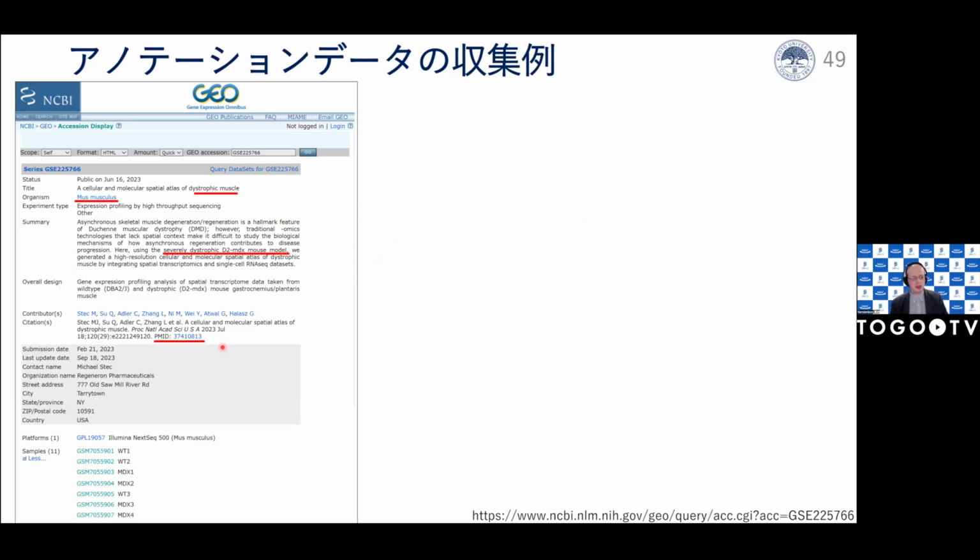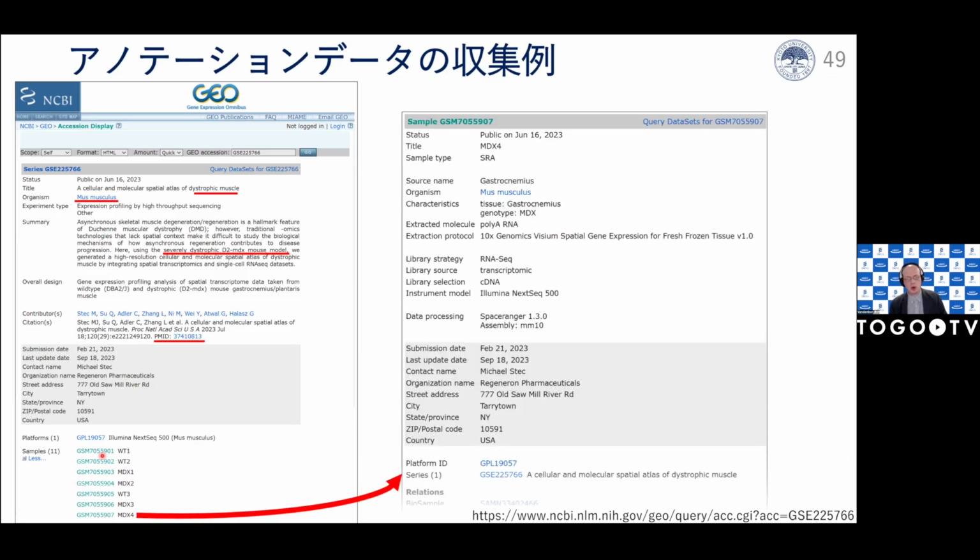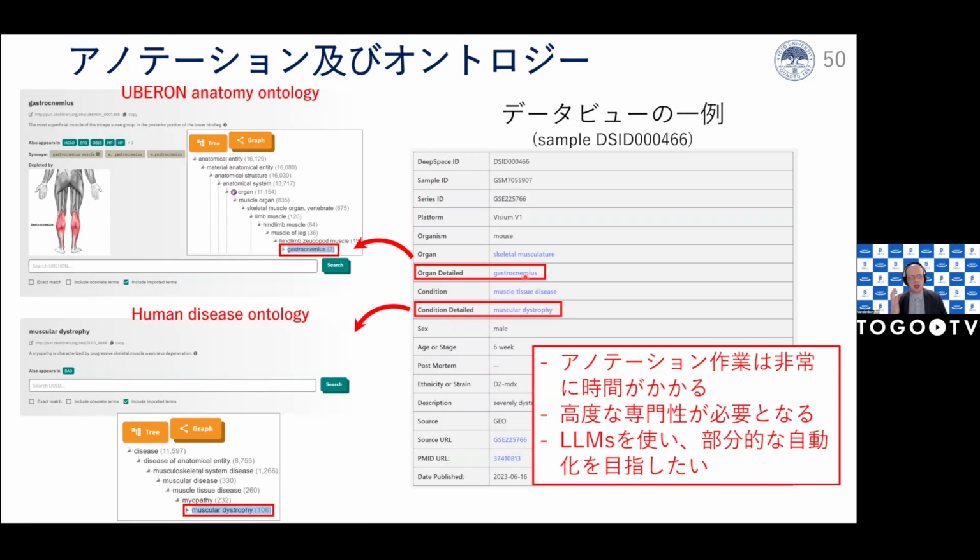Then we also link the paper connected to this series. Then we check how many samples there are, and for every sample, we open the sample page and check when it was published. Okay, this is the genotype MDX, and the tissue is gastrocnemius. Then we collect all this annotation data, and that's what's shown in our database.